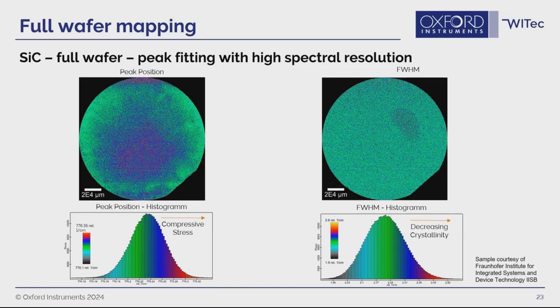As you can see, the distribution is almost homogeneous, except in the region where we saw the crystal facet. There a slightly wider peak is observed, and this can be explained by the different number of dopants, which cause slight changes in the crystal lattice.